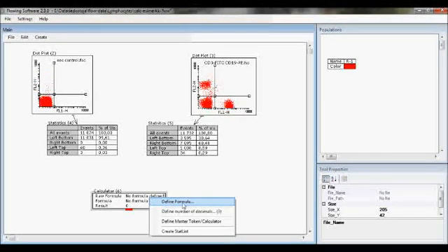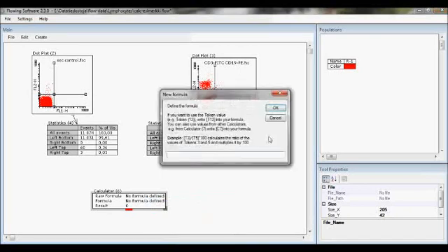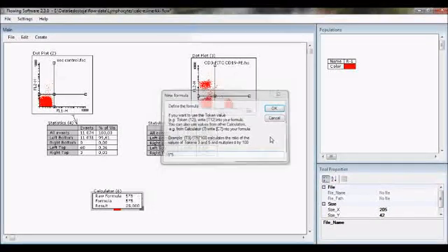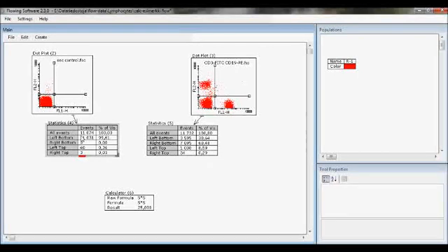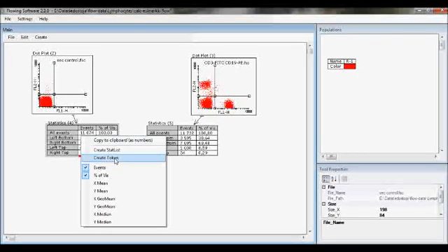The calculator can be used like this. I can define a formula. It can be anything. 5 times 5 is 25. Yes, that's good. But in the formula we can also use these numbers. Not directly, we need a token first.